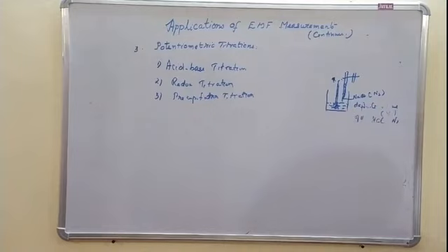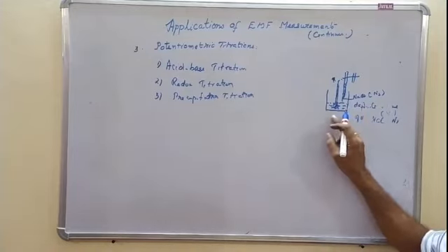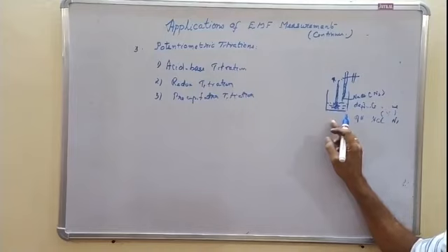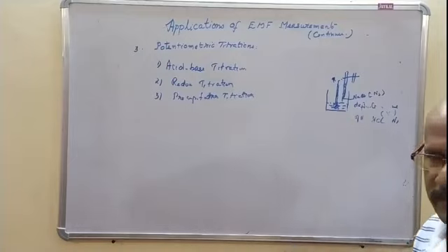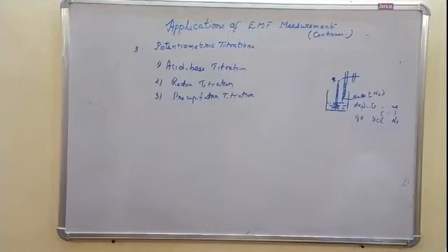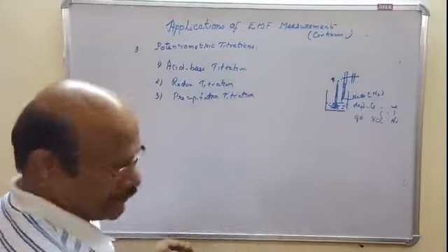Then on adding, you have to remember the reaction. The important point is that in the acid-base titration we are employing the indicator electrode, one whose potential changes with respect to the concentration of H plus ion. Usually the hydrogen gas electrode or a glass electrode is employed, and it is an electrode that is reversible with respect to the hydrogen ion. The reaction employed in this case is acid-base titration.